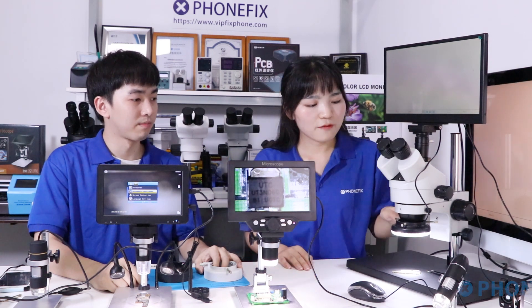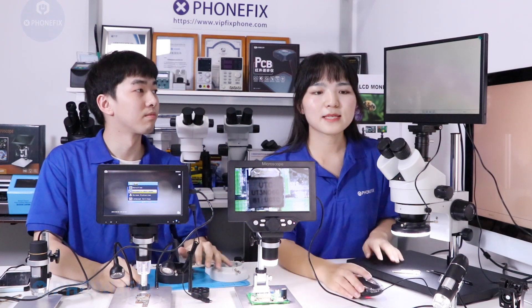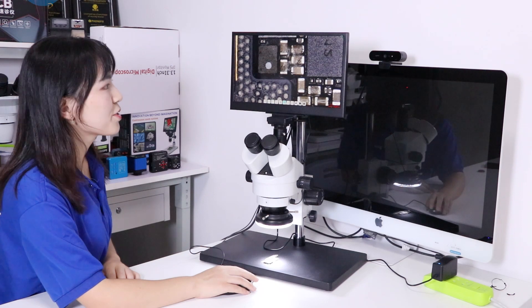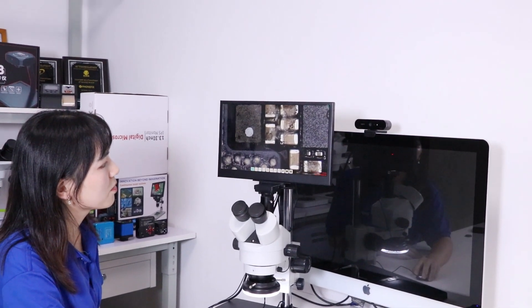You can install different lights when you set it up, such as a 56 LED ring light, 144 LED ring light, and oil cover ring light. Besides, you can control the microscope with your mouse. You can enjoy circle slides on the X-axis and control it with your mouse.